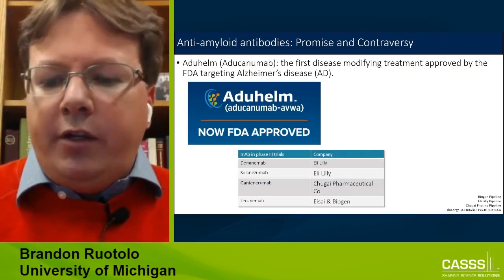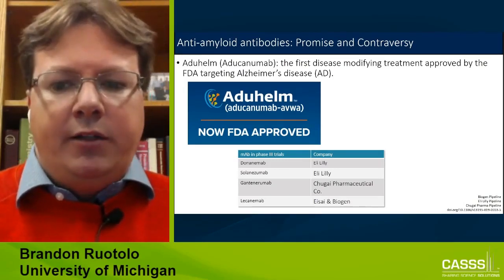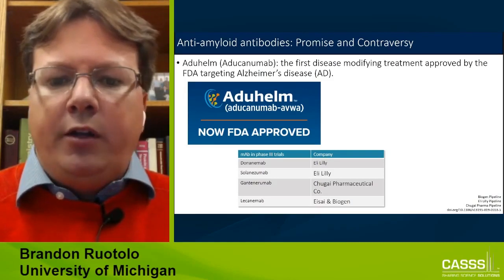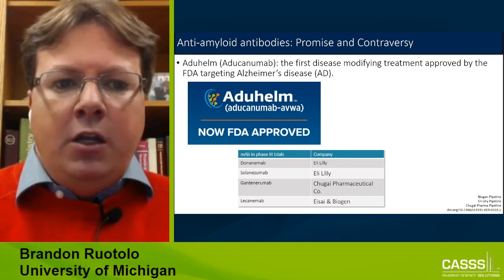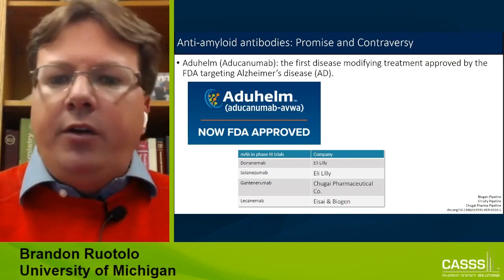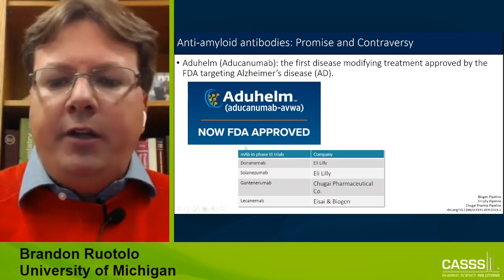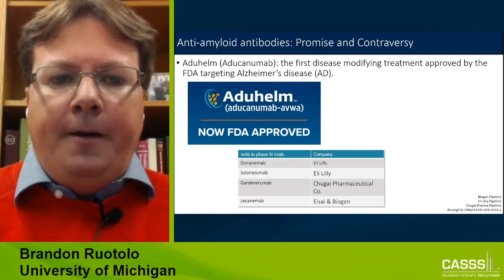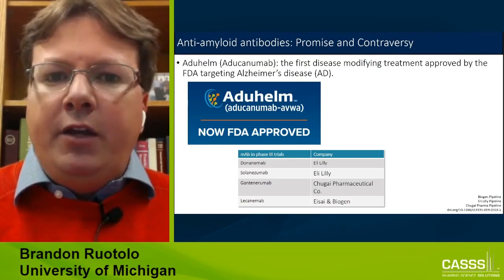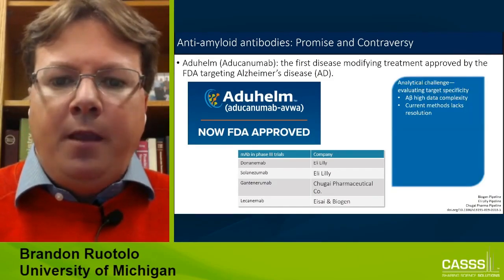So the last biotherapeutic vignette I want to show you is our work that we're doing on A-beta binding antibodies. This is relatively recent work that we're doing in collaboration with Pete Tessier's lab here at the University of Michigan. We're targeting a bunch of different antibodies in this space, but our inspiration was definitely aducanumab, the famous antibody that was just approved over the summer for targeting A-beta. These are, of course, really interesting and potentially controversial biotherapeutics for lots of reasons.